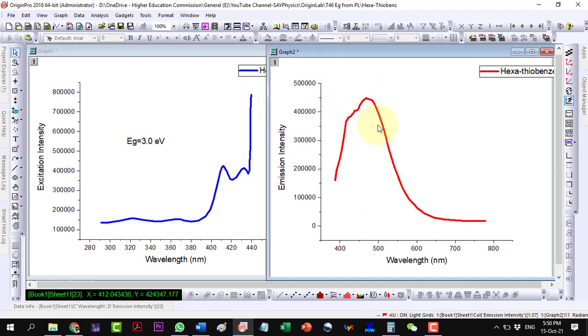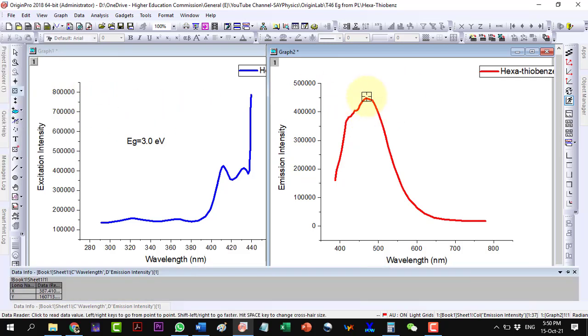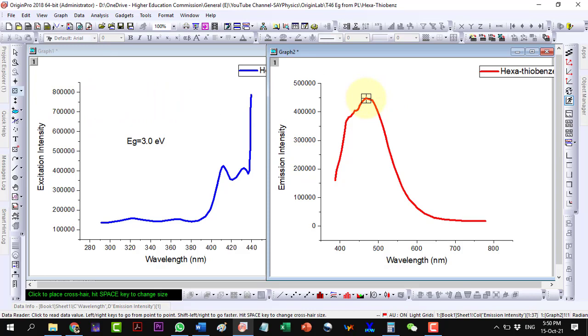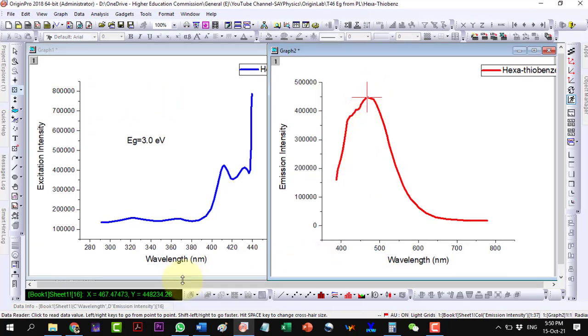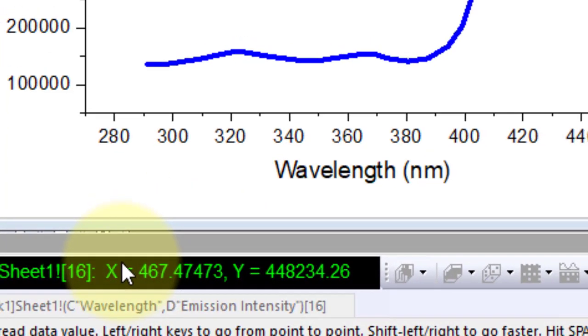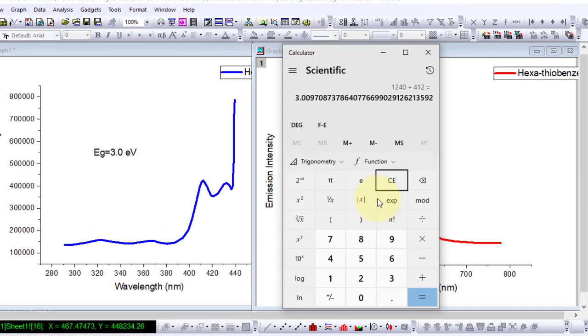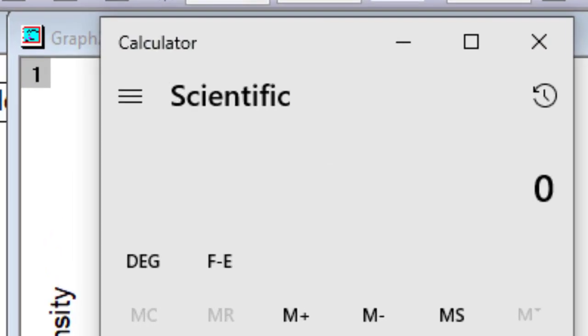Now, calculate the same value from the emission data. Here, in the emission data, we again use the maximum of the first prominent peak. This comes out to be 467.5 nanometers. Again, we will convert this value into electron volts by using the above-mentioned relation.